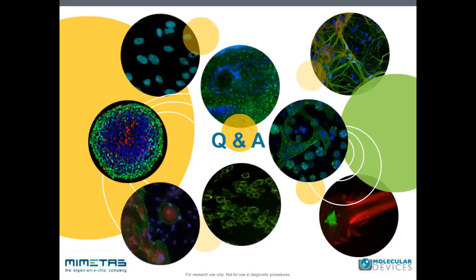Thank you. We basically use a range of methods, also depending on the type of model that we set up. So the simplest quality control is checking the phase contrast images after seeding or before assaying. Second, for the tube models, we often use a leakage test before we start to expose the cells in order to do the leakage assay.